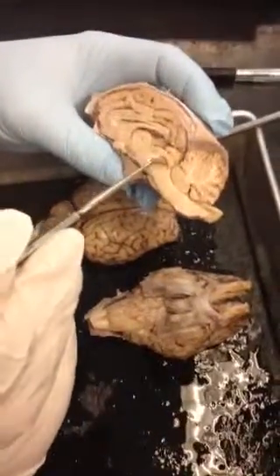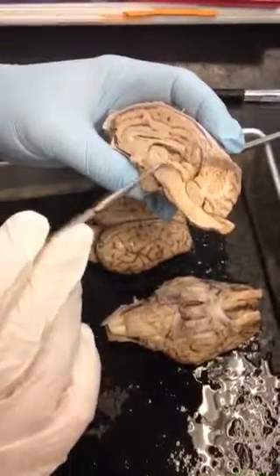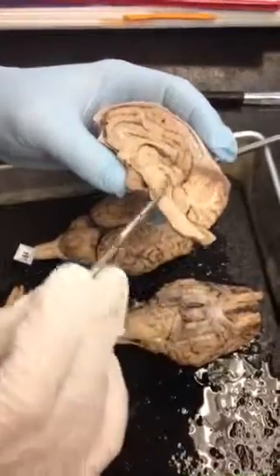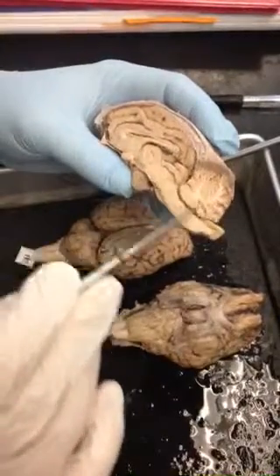The cerebral aqueduct does what? Connects the third and the fourth ventricle. So from the third ventricle, the CSF flows through this right here. It's a pretty good one, actually. This is the cerebral aqueduct right here. It's cut. And then down to the fourth ventricle, which is underneath the cerebellum.